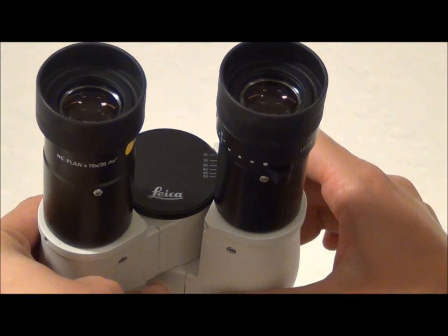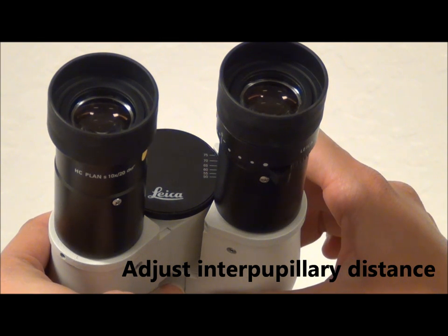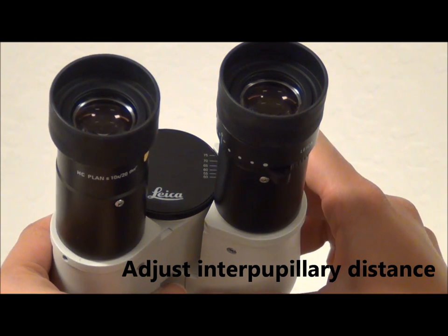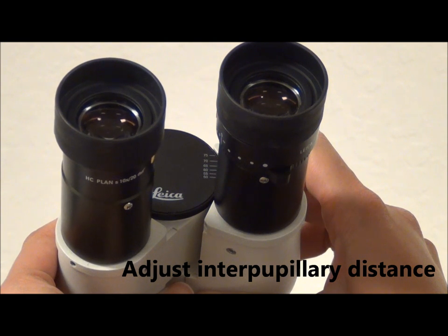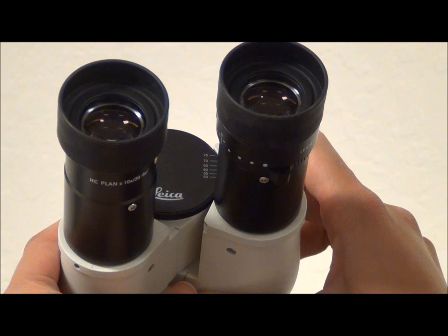This is the adjustment for interpupillary distance, which is basically the distance between the center of your pupils. Each microscope user should adjust this distance before using the microscope. Adjust the interpupillary distance by moving the eyepieces together just until the two fields of view merge to form a single field, yet far enough apart to allow your eyes to look through each of them without moving.